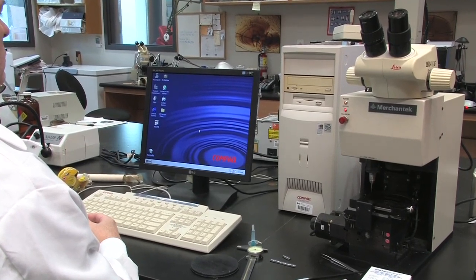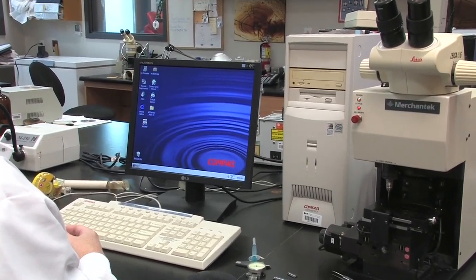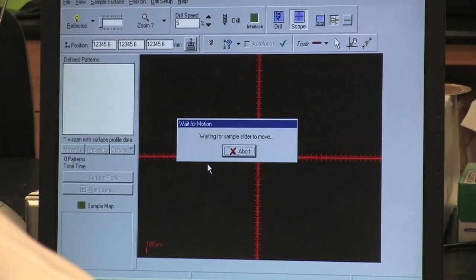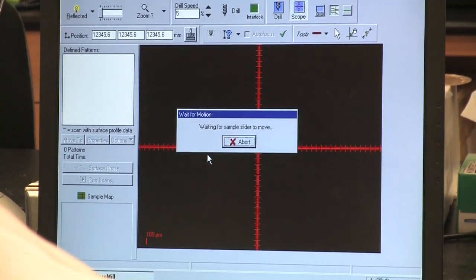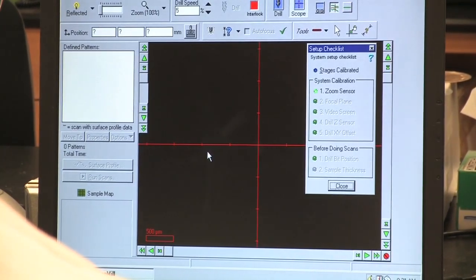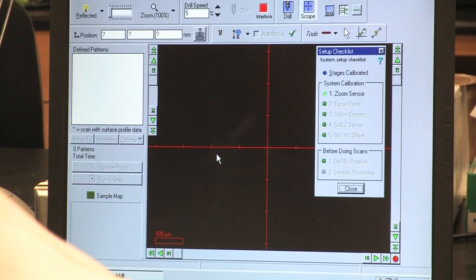Once the computer has booted up, click on the micromill icon on the desktop. As the program opens, a setup checklist window will appear on the right side of the screen and the z-axis stage will move to its upper extent.